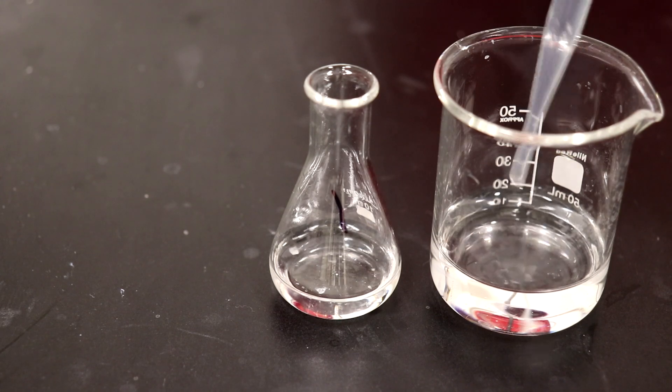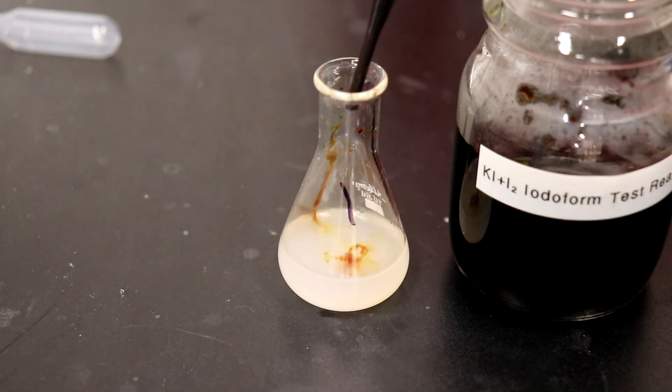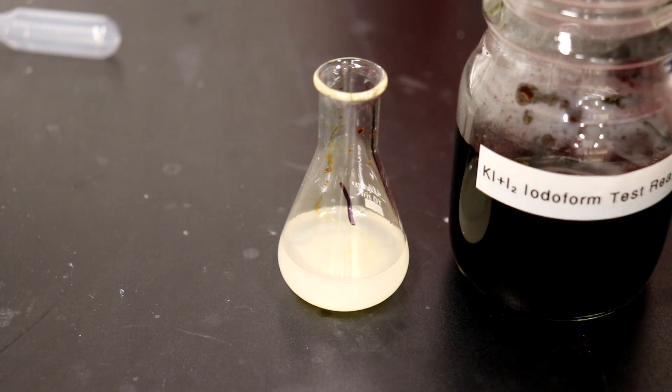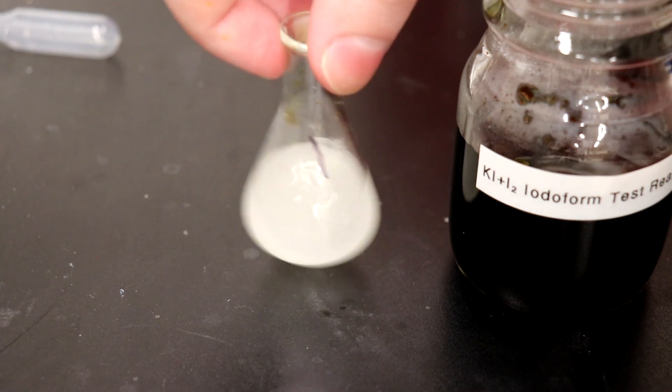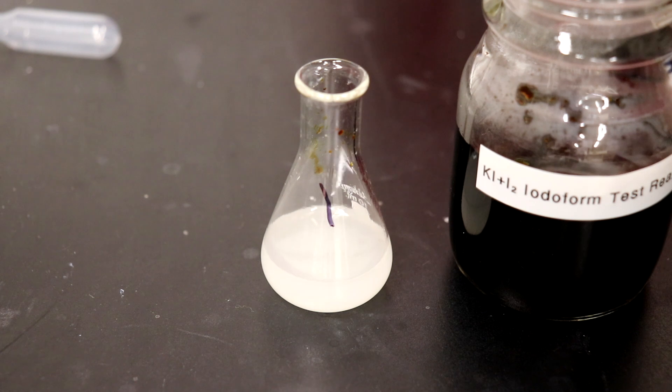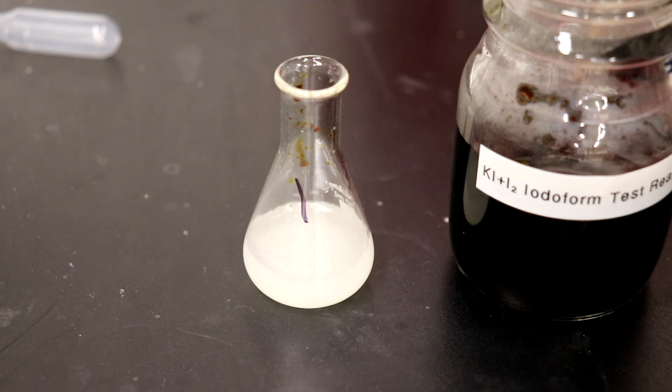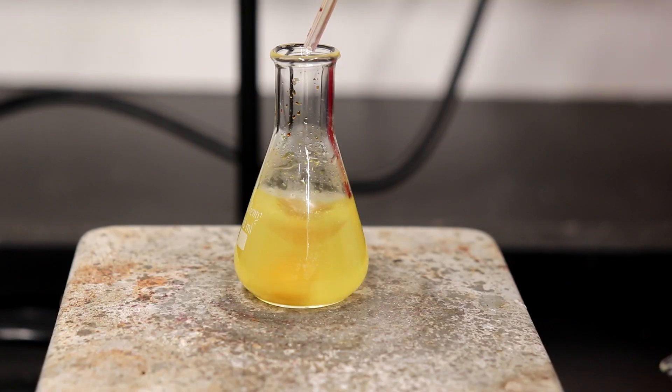Then 100 mg of the sample was measured out and dissolved in a mixture of 2 ml of water with 1.5 ml of dioxane. 2 ml of 5% sodium hydroxide solution was then added, and the testing reagent was added dropwise until it maintained a dark coloration of iodine for 2-3 minutes.